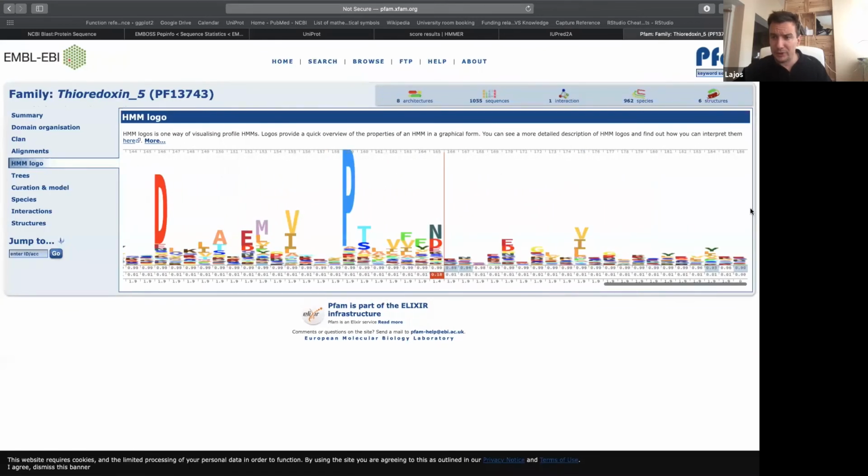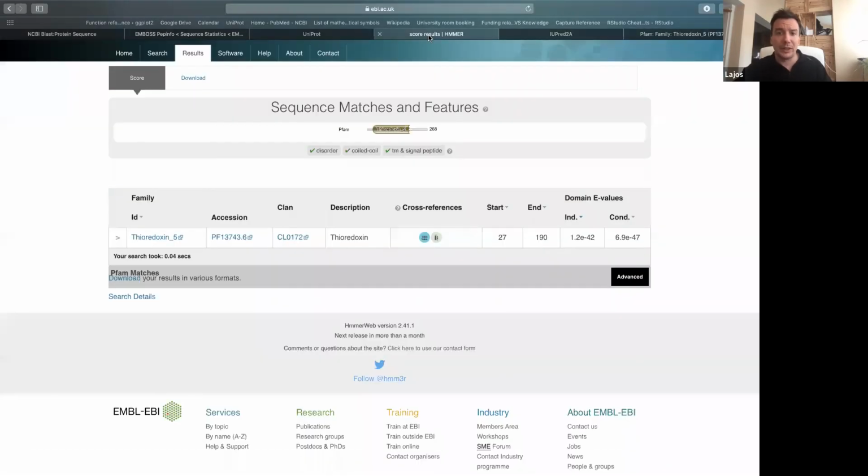Yeah, so this one is usually 186 amino acids, and what we have here is 160. So it's about 20 amino acids shorter, which is not really significant because we have most of the domain present. Okay, let's go for the next protein. So I think we are happy with this one.